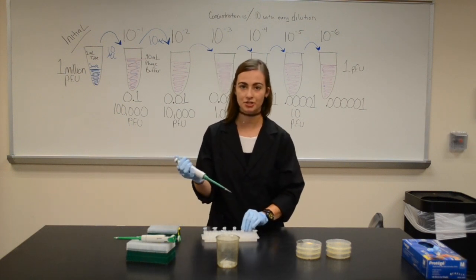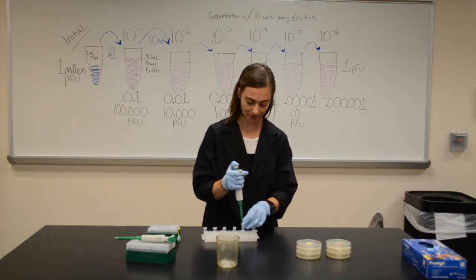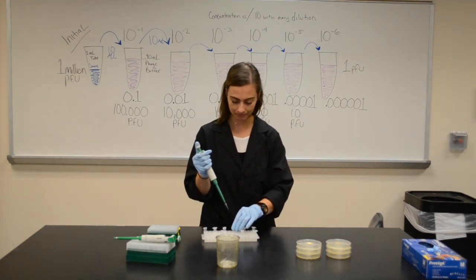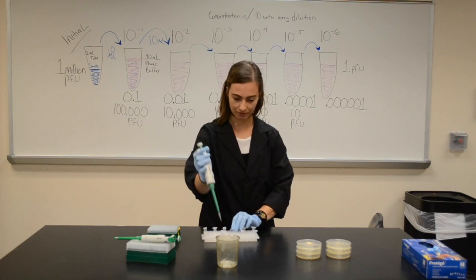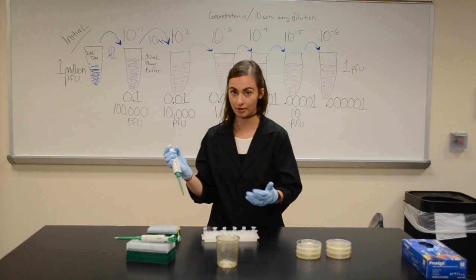Next, it seems repetitious but it is repetitious. I'm going to be moving 10 microliters of my 10 to the minus 2nd sample into 10 to the minus 3rd. I'm going to give it a little shake to disperse what I put in there.